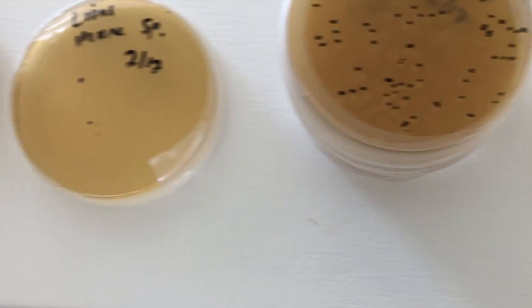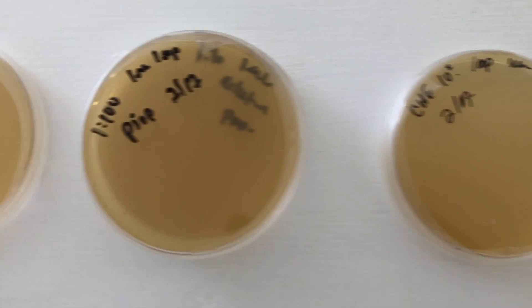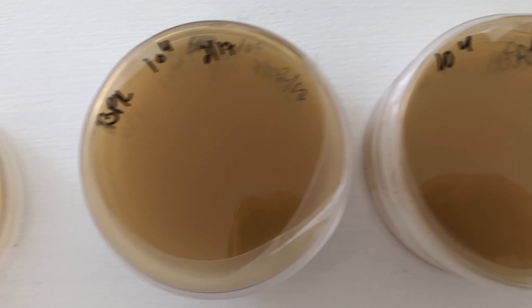That's the update at 48 hours. Looks like the bacteria is starting to show, but we've got quite a bit of clean plates.